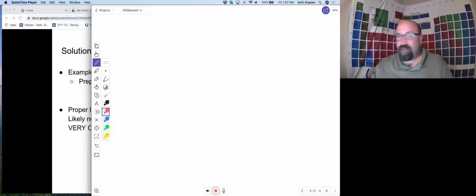So let's just sort of outline your tasks in this lab, because things are a little bit different from what's in your lab manual, again, just because of some of the changes that we are making due to this semester and our time constraints. For one, remember we're putting task 1 and task 2 together. You're doing both conductivity and pH today. You're doing the whole lab combined.